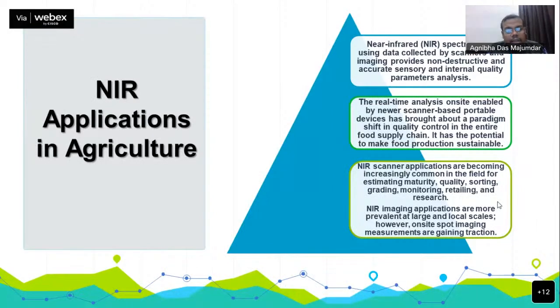Now, the NIR application in agriculture and food science, basically. Near infrared spectroscopy, using data collected by scanners and imaging, provides non-destructive and accurate sensory and internal quality parameter analysis. As I have told you earlier, the quality estimation of any food product cannot be done directly with the data of near infrared spectroscopy. We will have to make some statistical models. For that statistical model, NIR spectroscopic data is a very important primary data. Without spectroscopic data, we cannot develop any statistical model to estimate or check the qualities of any food product.